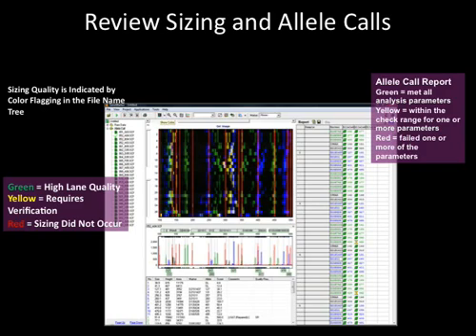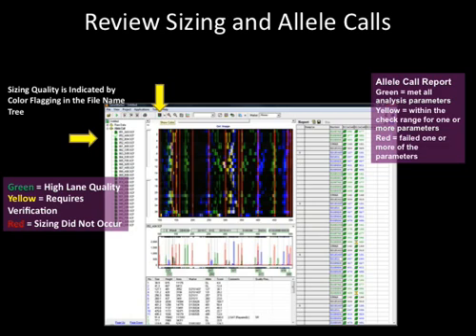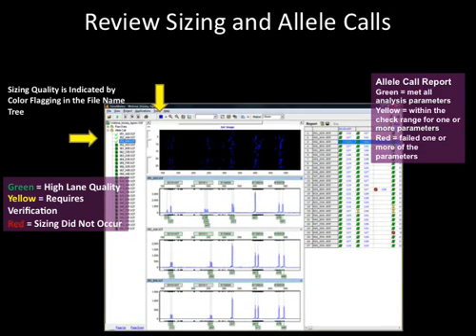To display one dye at a time, use the Show Color icon to toggle to the desired dye. Multiple files may be displayed by selecting them from the file name tree at the left. Sizing quality is indicated by color flagging in the file name tree: green equals high lane quality, yellow requires verification, and red indicates that sizing did not occur.